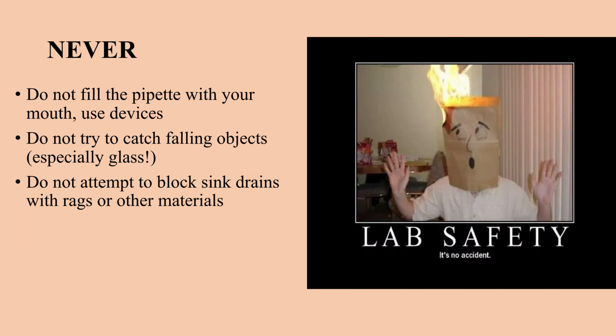You should not catch falling objects, especially glass objects. If a device or glass or pipette falls, it's fate. But if you try to catch it, you can damage your hands, catching these broken parts of the pipette or something.